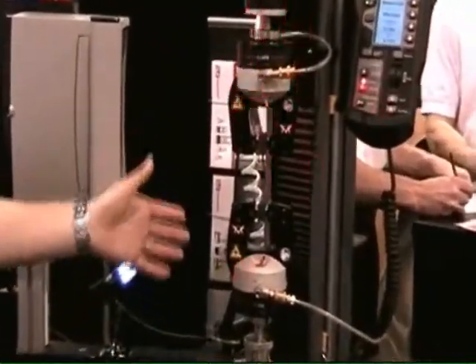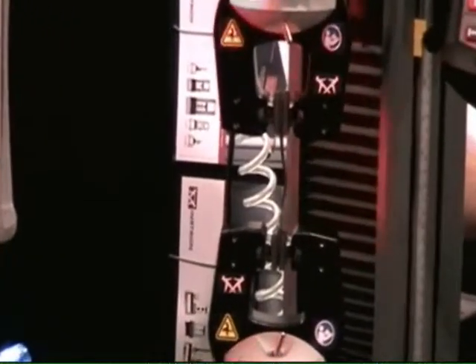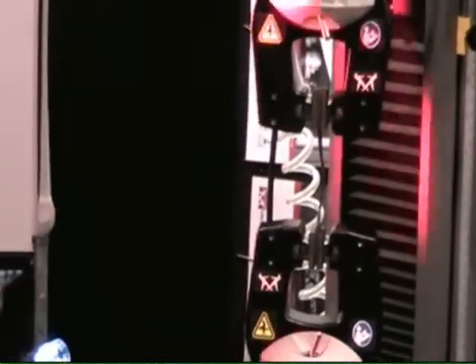There's also a new family of grips on the machine. This is the 1kN grips. We have 1, 2, 5, and 10kN capacities. A lot of usability and improved repeatability of results functionality has been added.